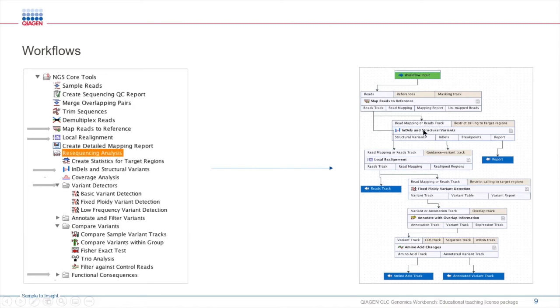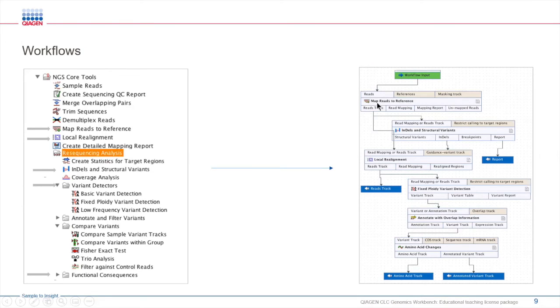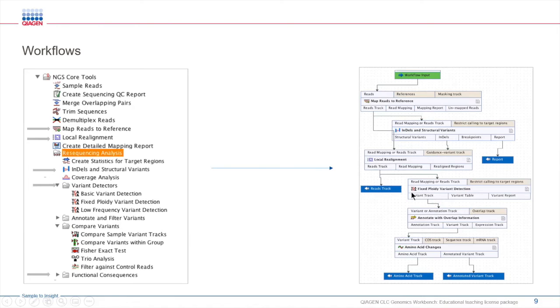This workflow may look a little bit complicated for those of you that may not be familiar with CLC, but it's pretty straightforward. Here we're just mapping our reads to reference, detecting some structural variants, aligning our reads, and then detecting some additional variants, and then looking at the functional consequences of those variants.